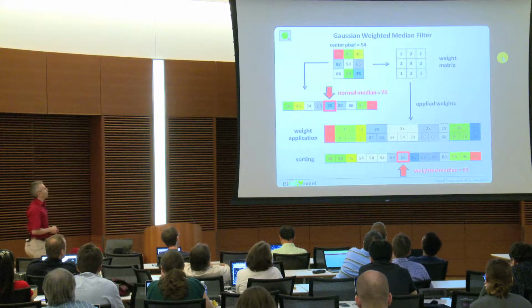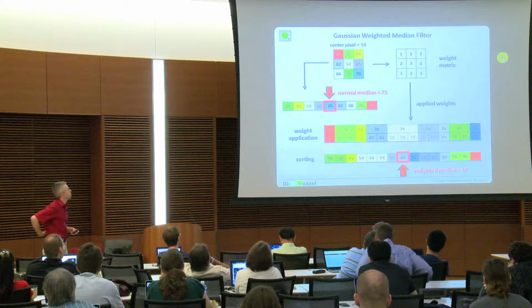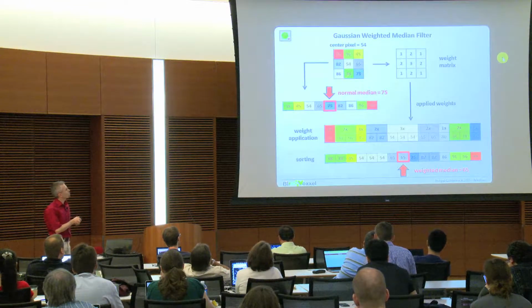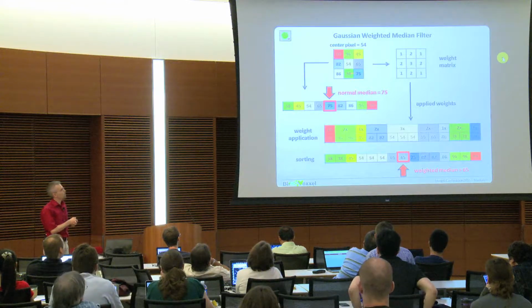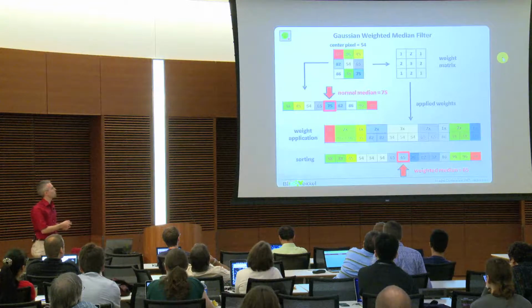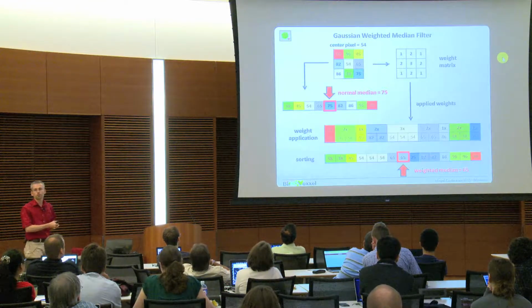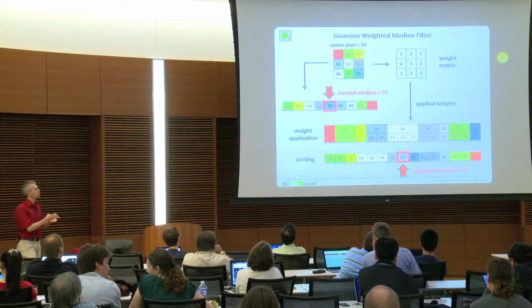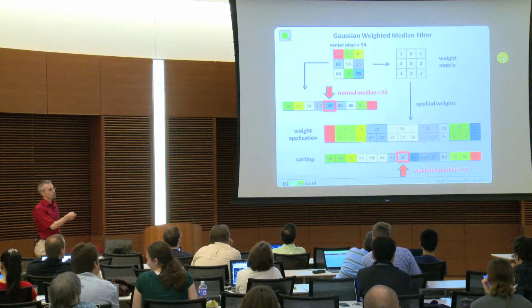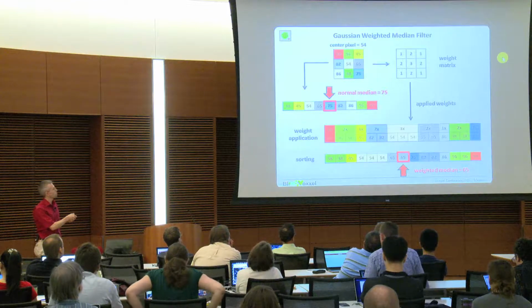So why is that? To also feed those of you who have a little bit more background in those image processing. So the normal median filter actually uses the values and gets the normal median value, so the statistical median value, by taking those values, sorting them by size, and then taking simply the value which lies in the center of the sequence. That is how it exchanges later on this pixel, which had originally a value of 54, by a new value which is 75.